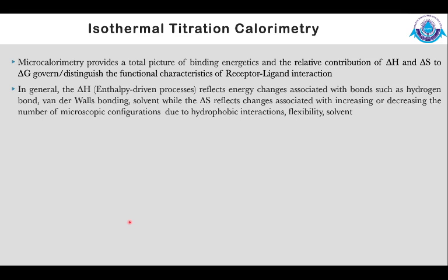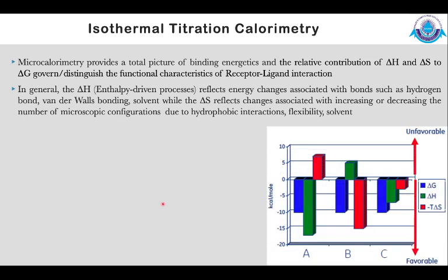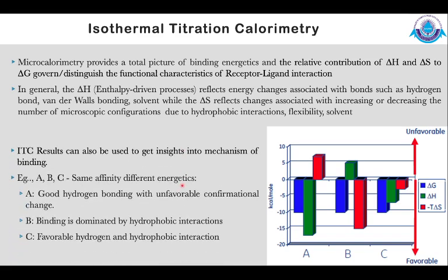In the absence of many hydrophobic interactions, the ligand is still going to be comparatively flexible, and hence it may not have a large delta S value. So the contribution will be hugely from delta H values. These are highly empirical conclusions that would give us a heading to understand the type of interaction. To understand this better, let us do an illustration with a typical example.